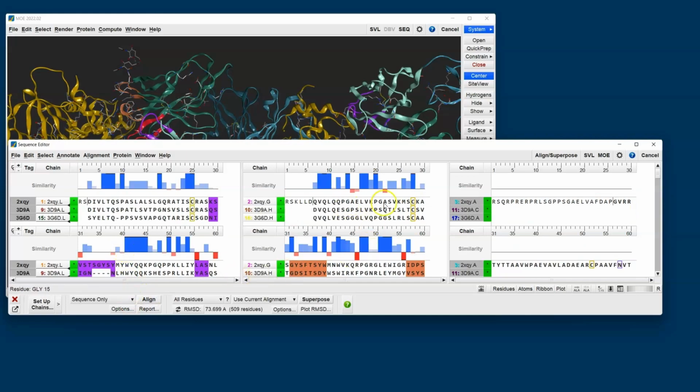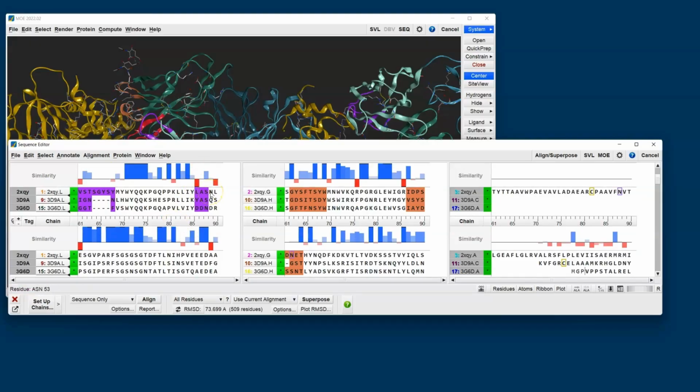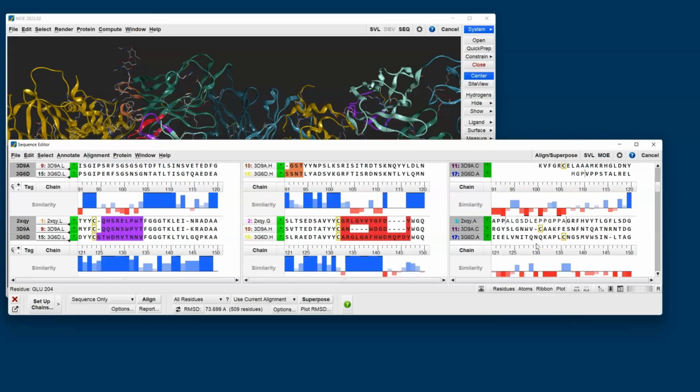So notice here that the sequence moved, but the atoms in the main Mo window did not. We see as well that blue bars now occupy most of our sequence, with the exception of the CDRs, which we typically expect, since we expect these to be different. In contrast though, the antigen is mostly red, and based on this alignment and this type of analysis, we can see that they're dissimilar, and there's going to be little sense in trying to superpose these. If we did, that would reduce the quality of our superposition, so we need to tell Mo to ignore these.